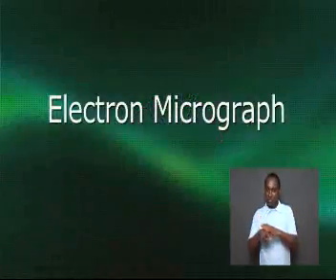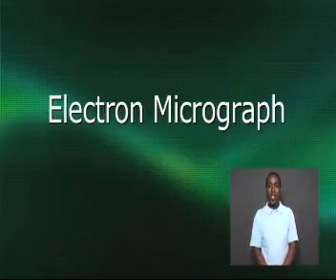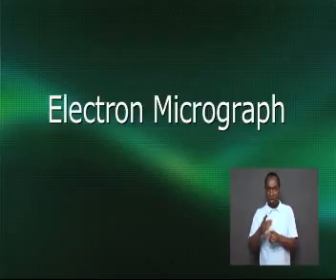An electron microscope works by having electron beams focused by magnetic lenses. A series of magnifications forms the image. The image is formed as electrons are scattered by the biological material of the specimen. Unlike a light microscope, you do not look directly into an electron microscope.